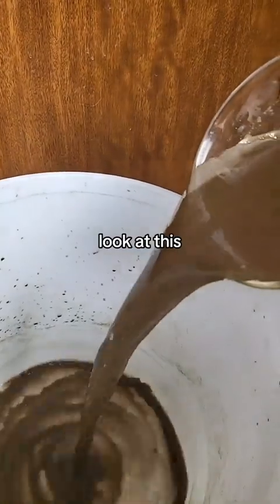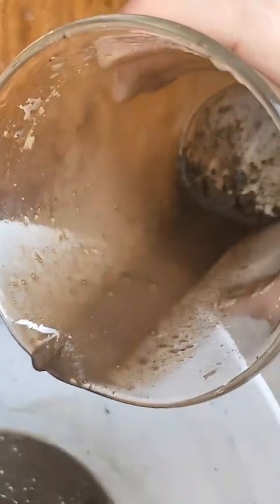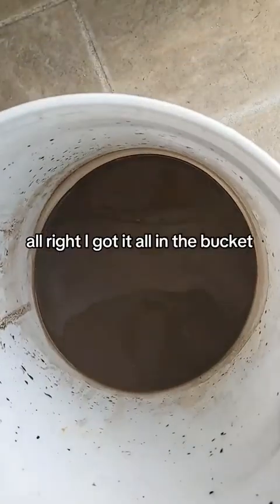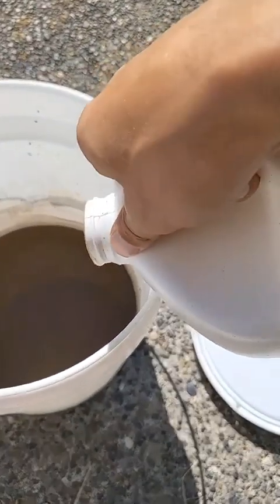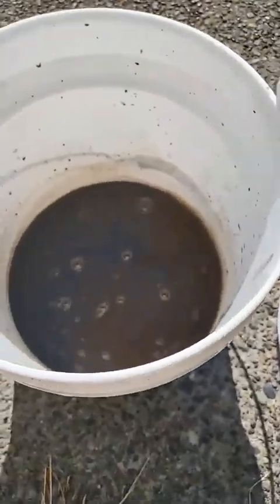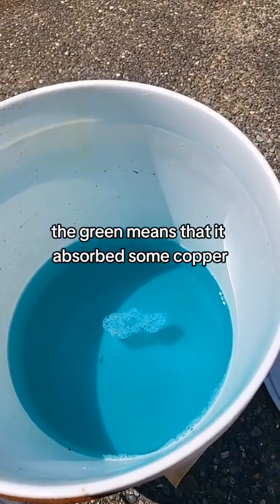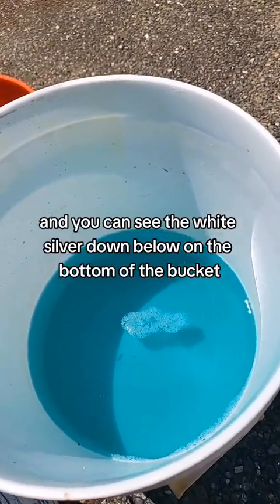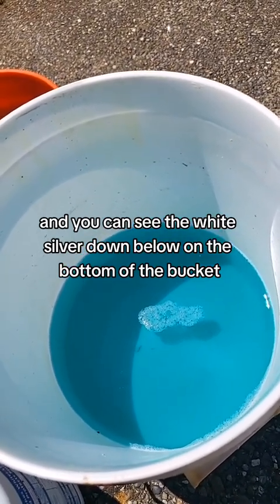This is so much material. I got it all in the bucket. Look at the color of that solution — the green means that it absorbed some copper, and you can see the white silver down below on the bottom of the bucket.